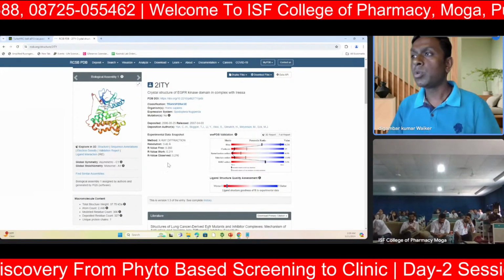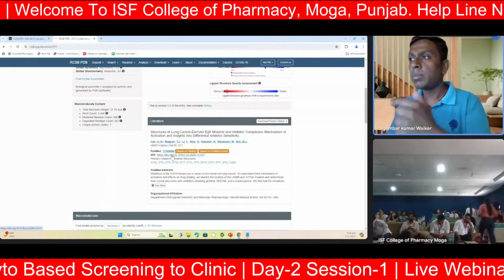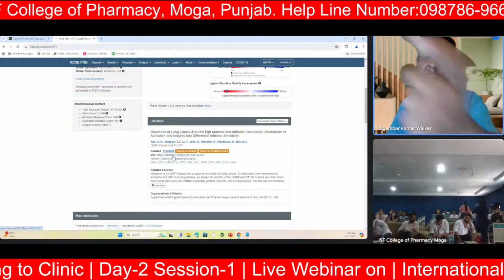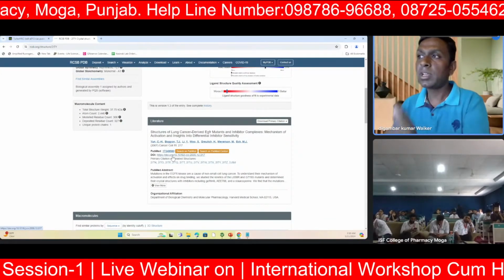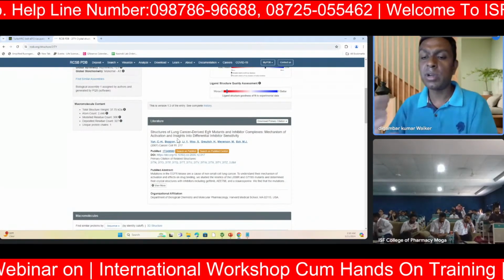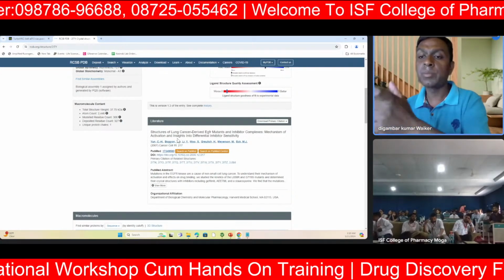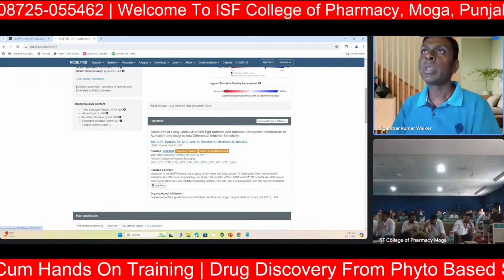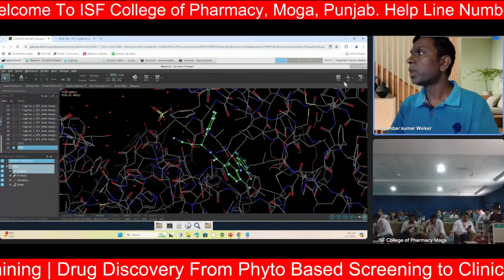So that is another important thing. If you want to study the important amino acids in that particular protein, you can go to the paper, because they have developed this structure, so they must have mentioned everything about this particular ligand protein interaction. You can get all that information from that paper, but that is not of our interest right now. So you can do that later on.